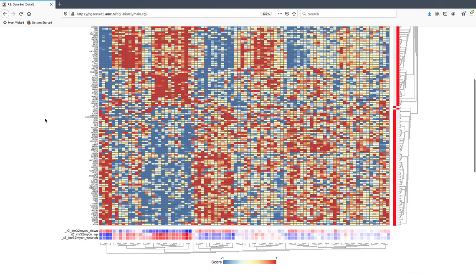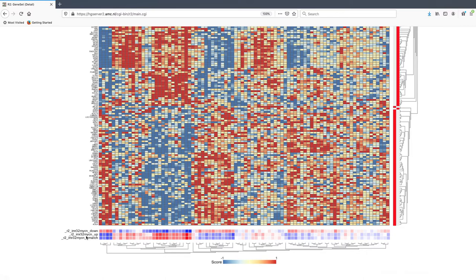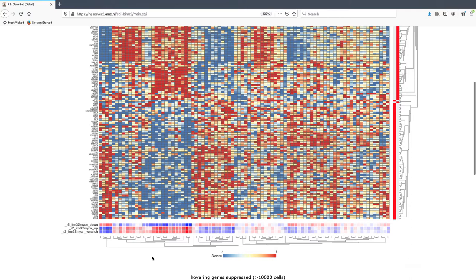Scrolling below the heatmap, we see a Z-score or signature score for each of the two gene signatures — one for the up regulated and one for the down regulated signature. Below both, there is something labeled W-match, which is a weighted signature score: the up regulated signature minus the down regulated signature, adjusted for the number of genes in each group. This overall weighted signature score requires that you provide both an up and down labeled gene list as input.